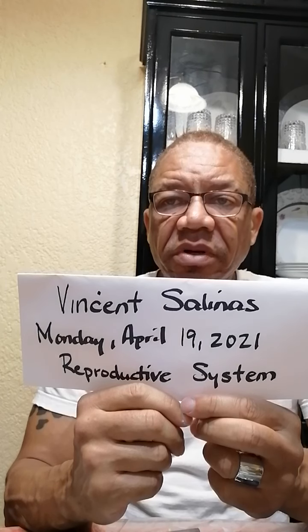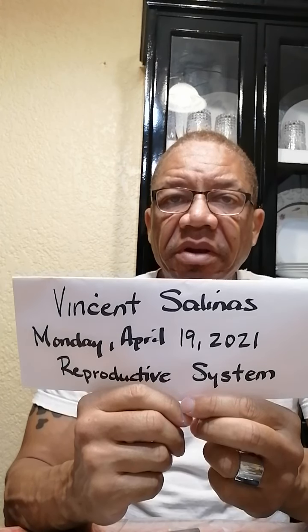I'm going to be doing a video presentation on the reproductive system. I'm going to start off first talking about the common diseases of the reproductive system, and then I'll go to the actual dissection. So I'm going to begin with the male reproductive system.